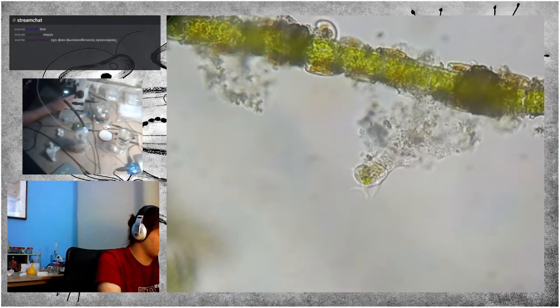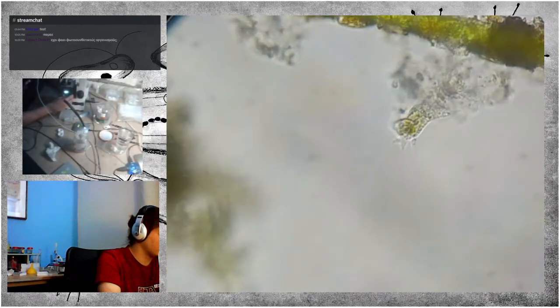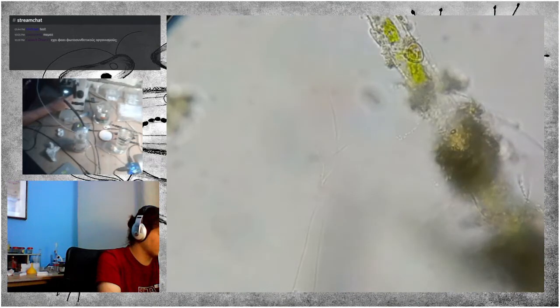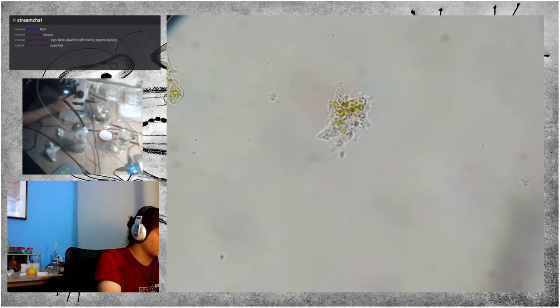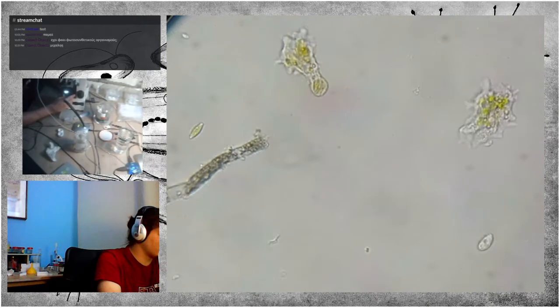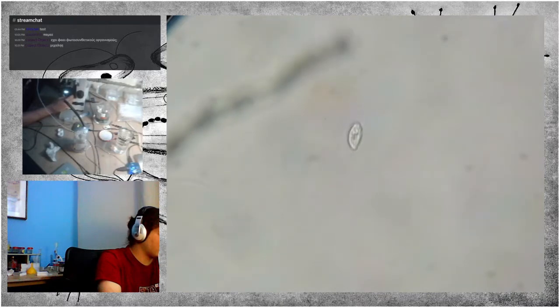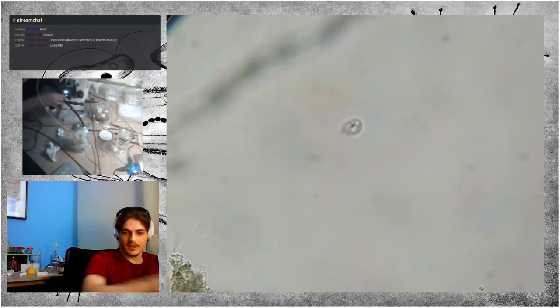Now let's move on. We'll return to the amoeba later, probably. Although I would like to check out the... Oh, I think this organism, let me see.